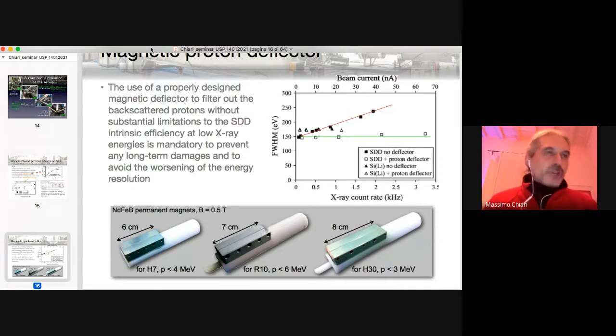So for most of the applications, the qualitative information is more than enough. Except if you want to look at low Z elements like boron, lithium, where we have an application in our laboratory with people from the geology department, where they are studying ceramics from the 18th century on, and they have come to the conclusion that the presence of boron in the ceramic can be used to distinguish a more modern or ancient ceramic.